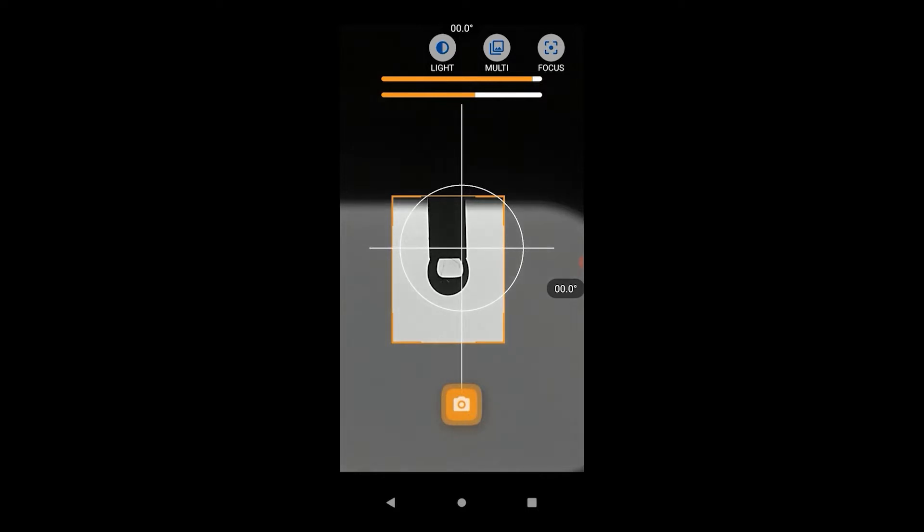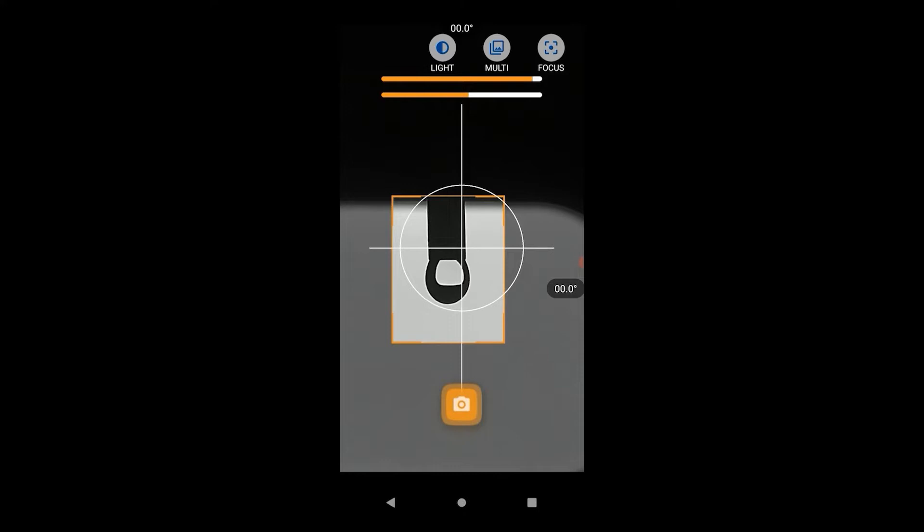Generate a droplet large enough that it is sufficiently deformed by gravity. A nice teardrop shape is recommended. It's best to aim for a droplet that's just about to detach from the needle.